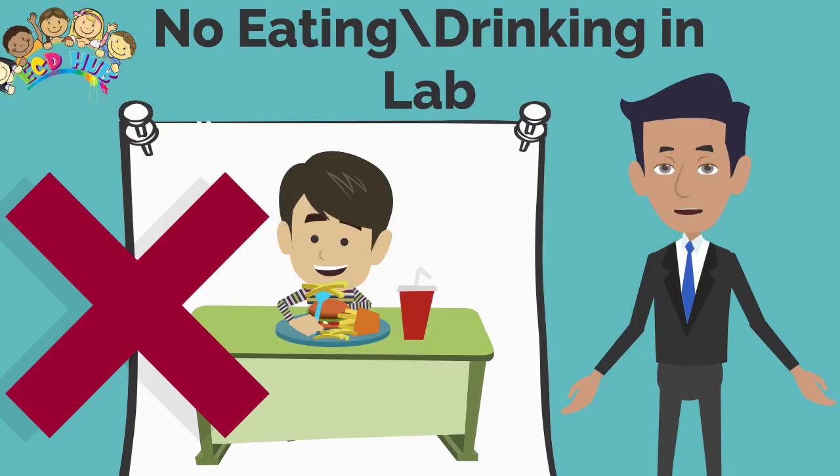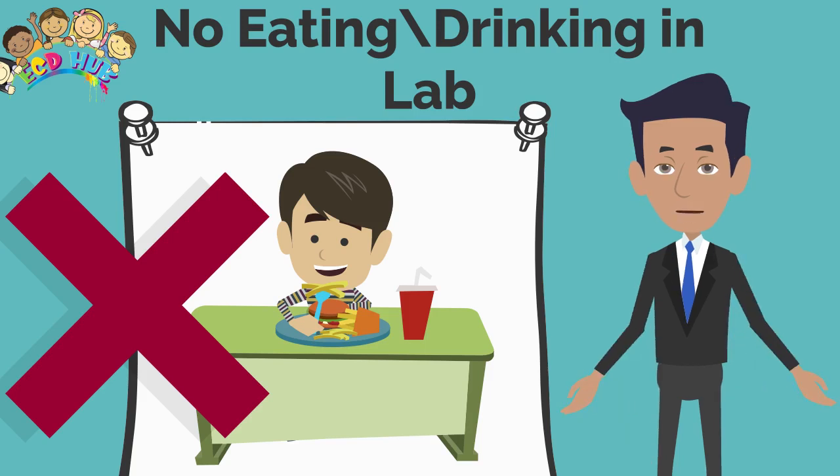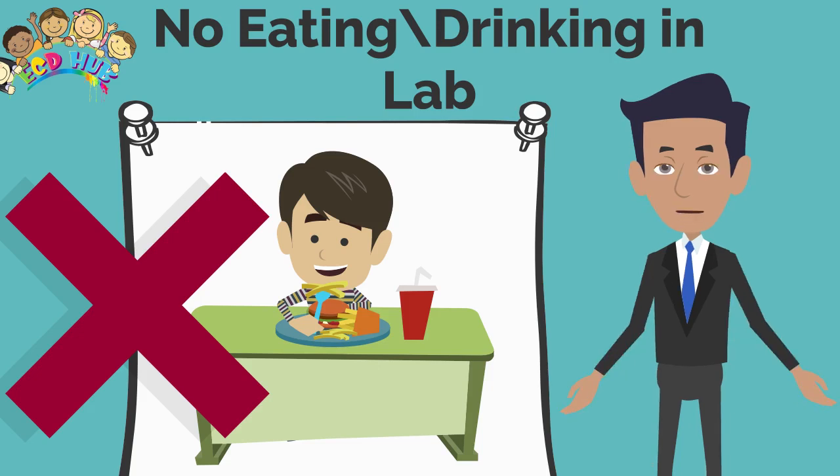There will be no eating or drinking during lab. There are days that we may be using chemicals, and I don't want you to get sick. Also, the lab tables may have had chemicals on them previously that were not properly cleaned up. So, you should not eat or drink on them either.